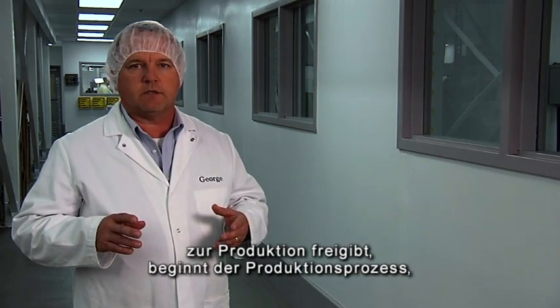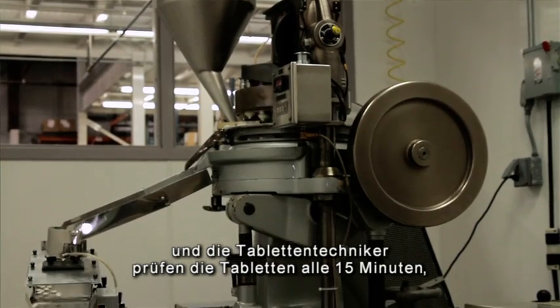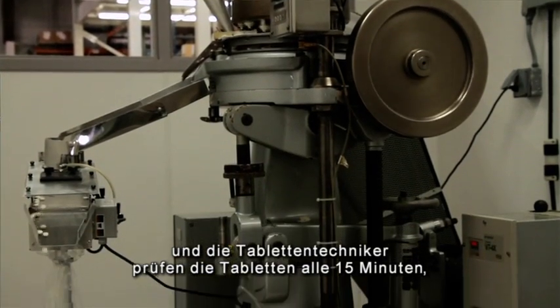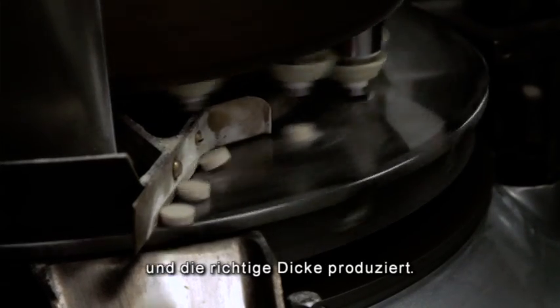Once quality control releases the press to begin full production, production will begin, and the tableting production personnel will check the tablets every 15 minutes to make sure the proper weight and thickness are being delivered by the tablet press.